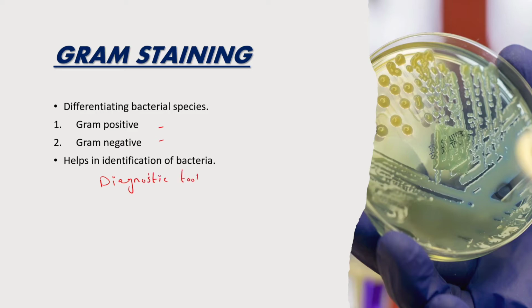Not all the bacteria can be classified by this technique. This gives rise to gram variable and gram indeterminate groups as well. This technique helps us to identify gram positive or gram negative, as well as the gram variable and the gram indeterminate.